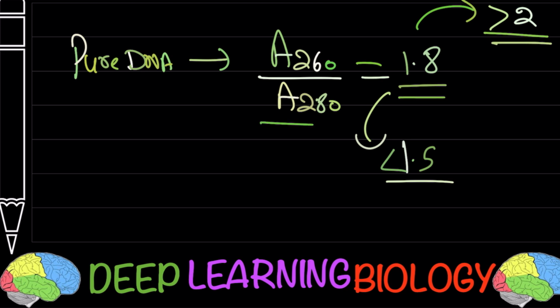So keep in mind, most of the time when we work in the laboratory, we also check this absorbance 260 by absorbance 280 ratio. Okay, so hopefully these basic points are clear to you.